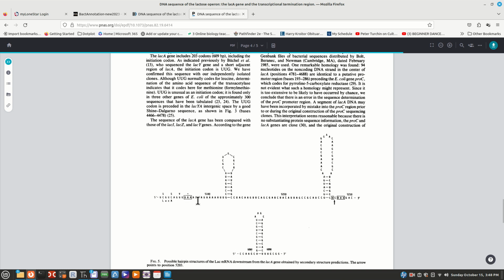And 50, 20, this one, if it's this one, you didn't go very far at all. Here, maybe 20, not even that, 15. This is probably more typical. And so this is a good spot. It's got the U's, even though they're not 5 really, or 6. They are right after it. There is a U right here. But this one's hard because the stem is so short. And that's what you're looking at with dot plot. You're looking at this piece.